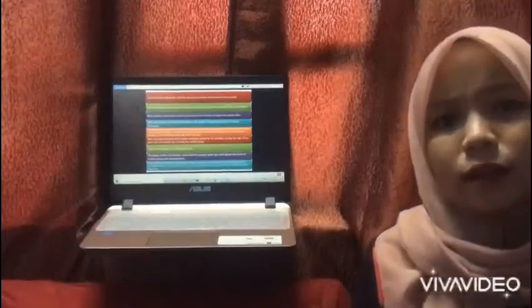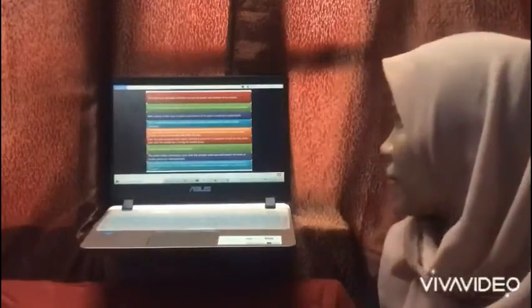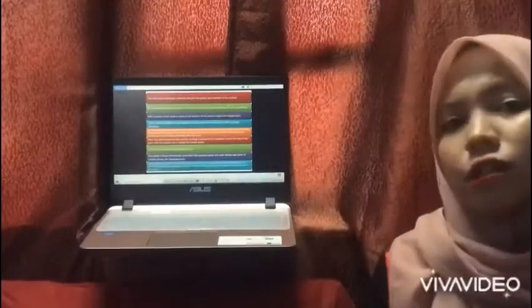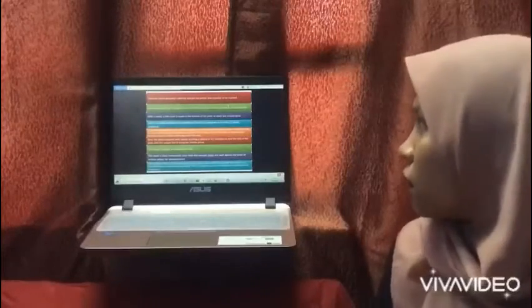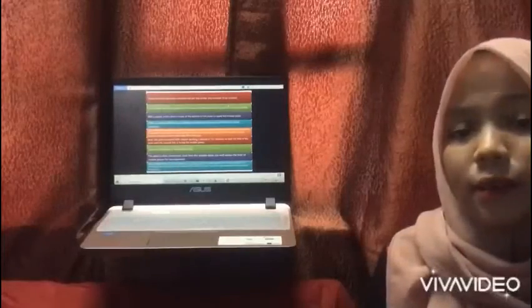Today I would like to present about my slide, that is preparation of samples. Firstly, we have to collect the fresh leaf and put it into the chamber and vessel to be crushed. Then the stationary phase is applied onto the plate uniformly, then allowed to dry and stabilize.